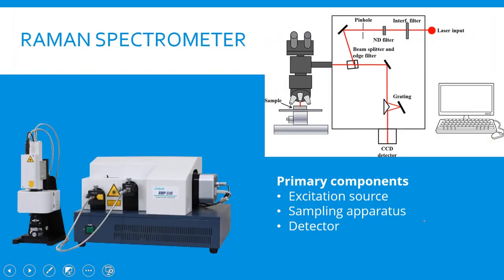Now let us see how we can take a Raman spectrum, and this Raman spectrum is taken using a Raman spectrometer. As you have already noticed, these Raman lines are going to be very feeble. We are looking into the hyperfine structures. We are looking into the Stokes lines, then zooming into it to see the rotational hyperfine structure, then again zooming into it to see the rotational vibrational interactions.